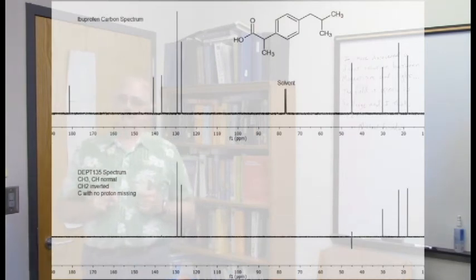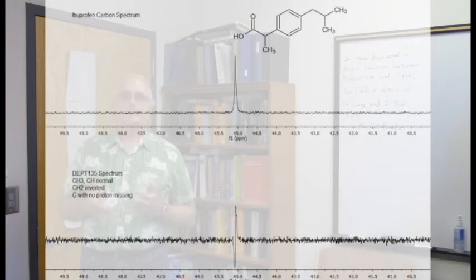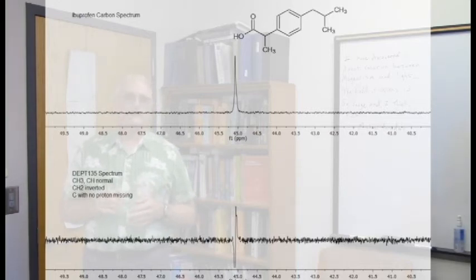This is the interesting part right here. For a moment, I thought I had a phasing issue or something. It looked like this peak was just badly distorted. But no, I checked the phasing and all the other peaks looked fine, and it had finally dawned on me. It takes a while sometimes, but it finally dawned on me what I was looking at here. This is, and these are two carbons. This one signal, while it looks like a, it doesn't even look split when you zoom in on it, is actually two carbons. And in fact, it's a CH group and a CH2 group, CH group in the DEPT 135 pointing up, CH2 group, which is in ibuprofen, pointing down.